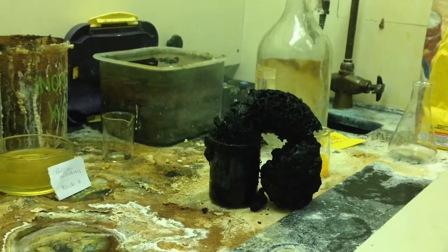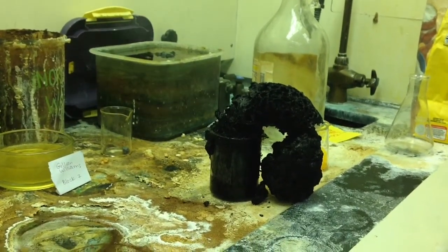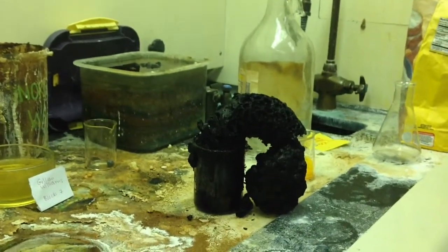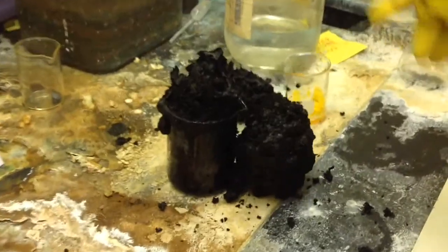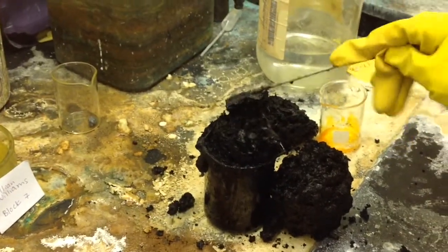Heat is also produced, indicated by the hot steam emitted from the carbon as well as from the hot temperature of the beaker. The graphite is very messy, and one must neutralize the remaining acid with baking soda to clean up.